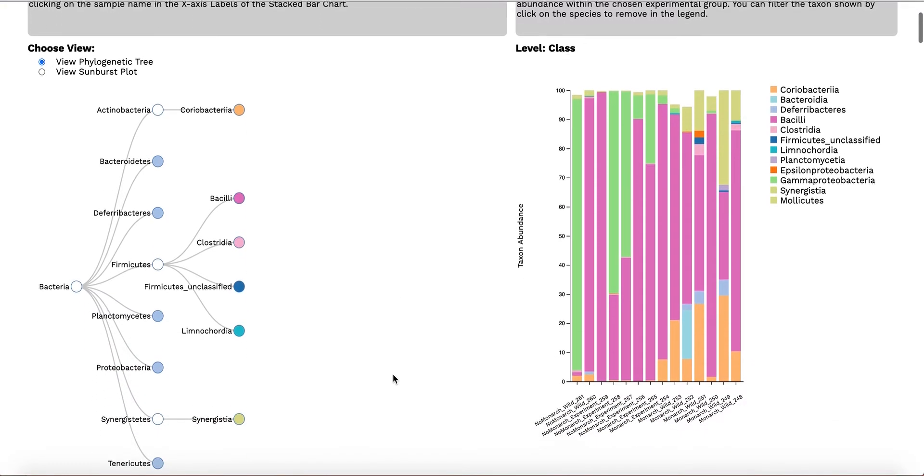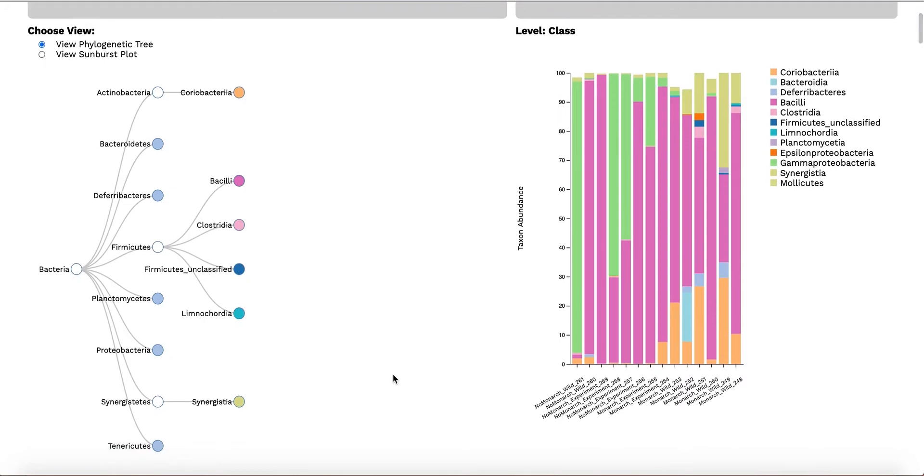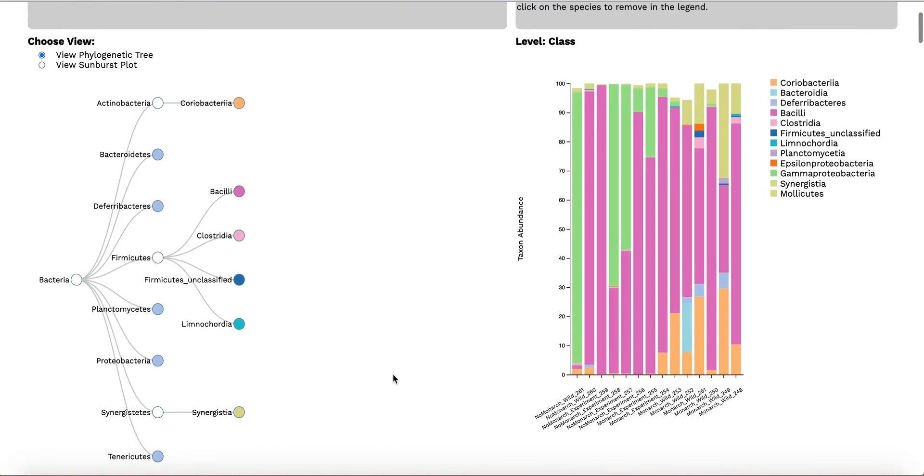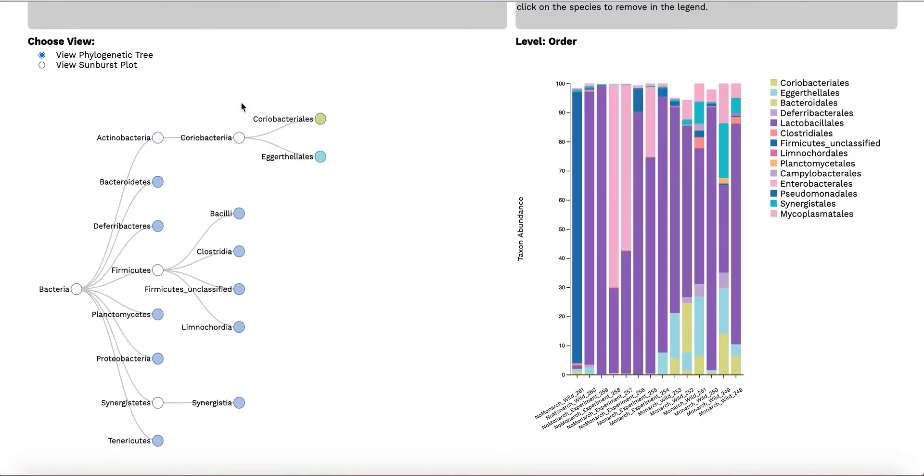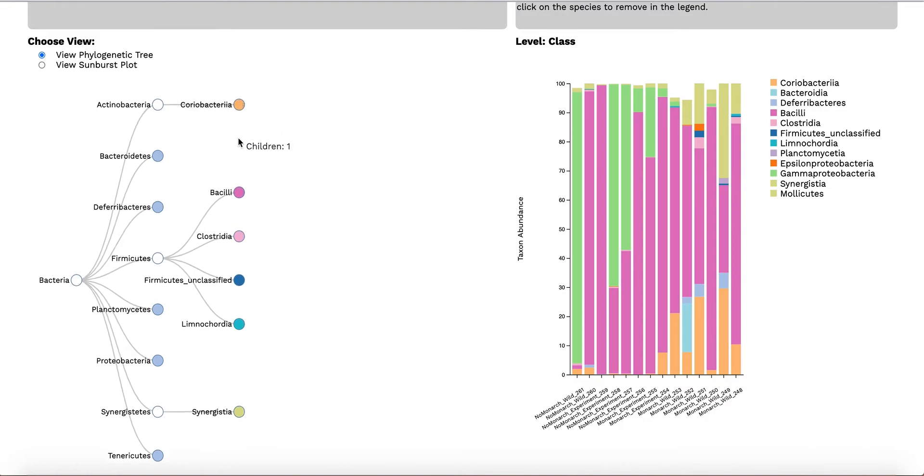In the phylogenetic tree view, the user is able to see the evolutionary relationship between the species found in all the samples. The user is first presented with all phyla classified across the samples. Clicking on a node will expand a branch, revealing further taxonomic divisions, and clicking again will collapse it.